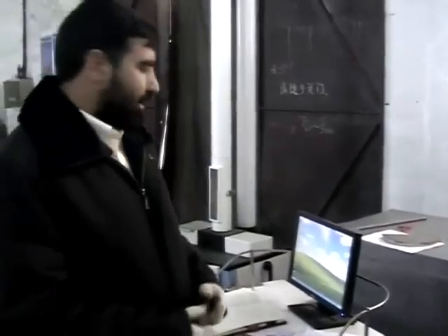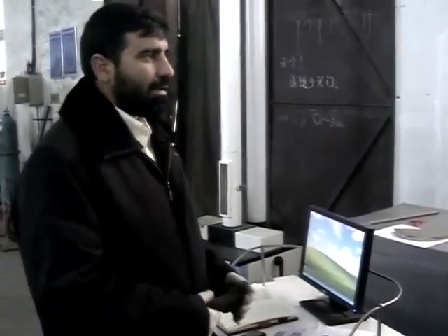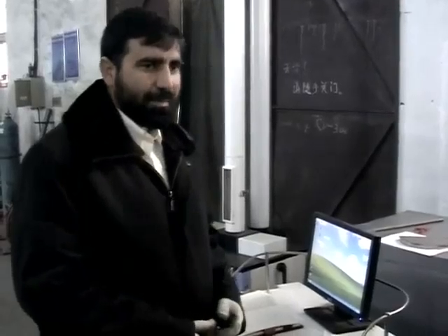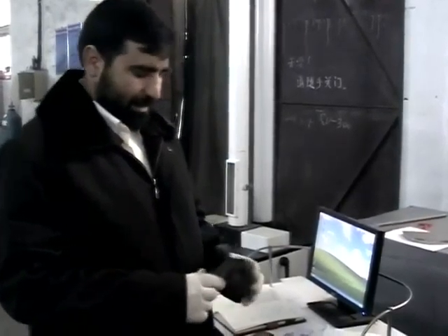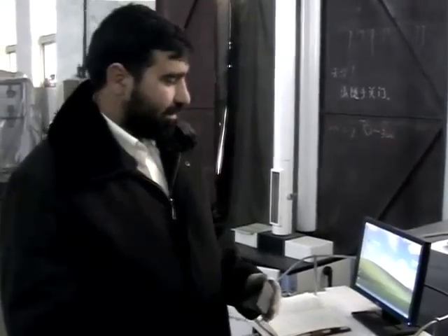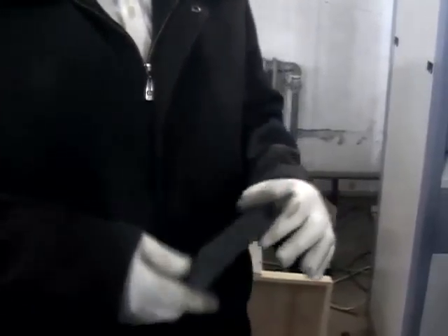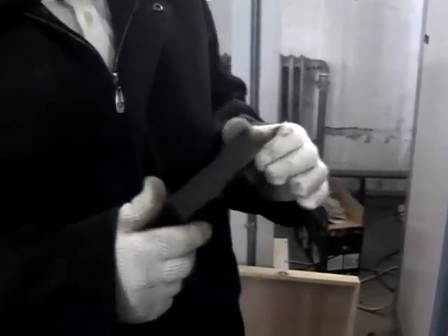At last we reached the test by our universal equipment, the tensile test. First of all, we want to make a sample for tensile. We will take a piece of our pipe, just only this for PE, and we will put this in the sample making.